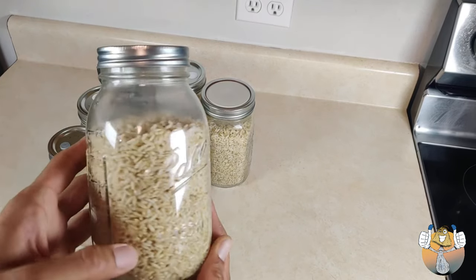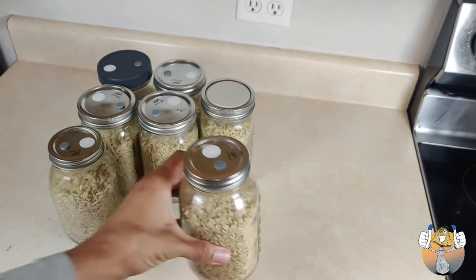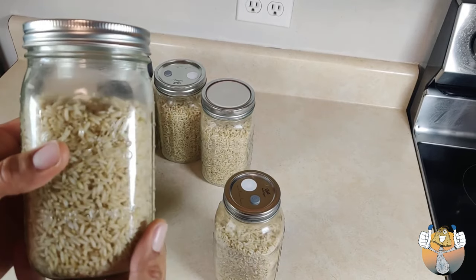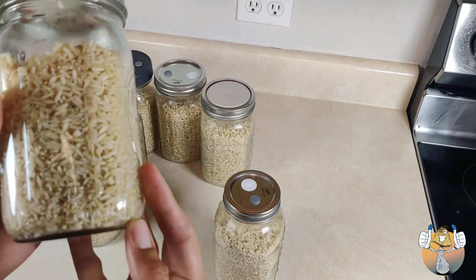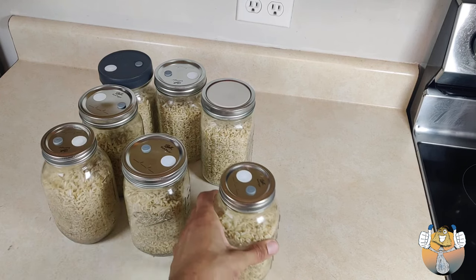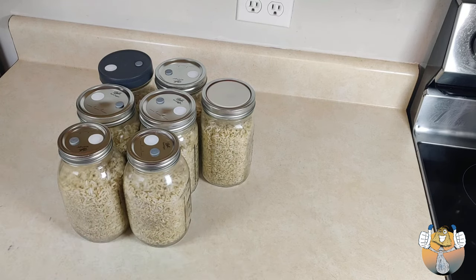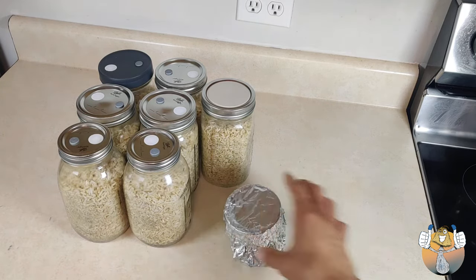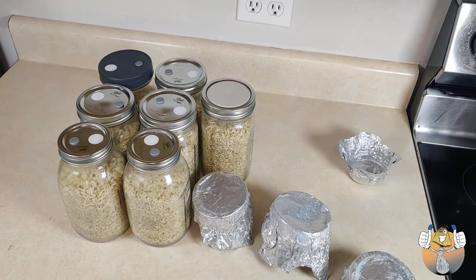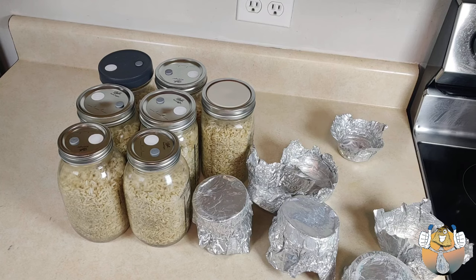All right. So we have our jars pretty much filled to the top, just enough space to leave for a break and shake. And this is not the full 3 pounds of rice. For 3 pounds of rice, we do get 9 quart jars. And I will be filling 9 quart jars. I just needed to go and get 2 more jars. And I also have 1 unmodified lid in there just to test and show you that you do not need a modified lid when you prepare your grains.